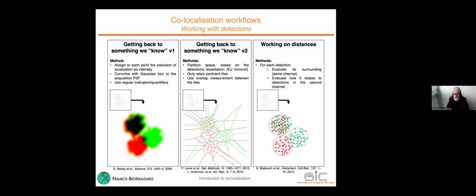Okay, so I don't know about all the websites, but the easiest way to analyze colocalization for years and years has been Pearson and Manders. Basically, it's a coefficient that is easy to compute, so this is what is implemented behind.